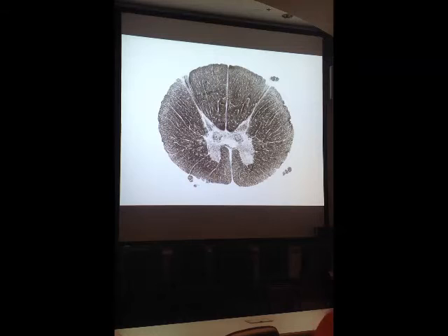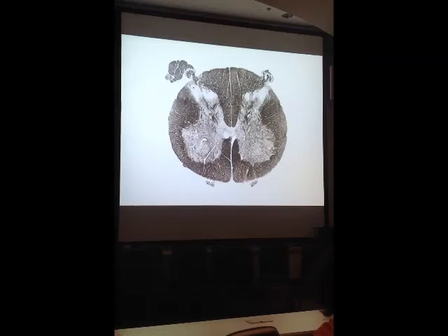Before we leave the slide real quickly, that should be a no-brainer. What is that right there? Dorsal root of the spinal nerve, which hasn't quite attached to the cord here. And what is this right here? It's a ventral root of the spinal nerve, which has already taken off from the cord. Okay? And then the final slide, and by the way, that previous slide, I'm sorry, was number 3. I didn't say that. This is the last slide.